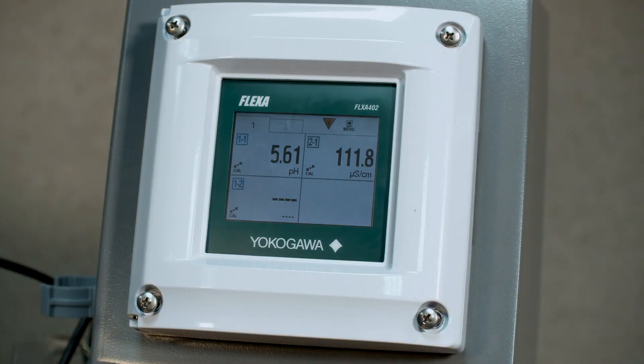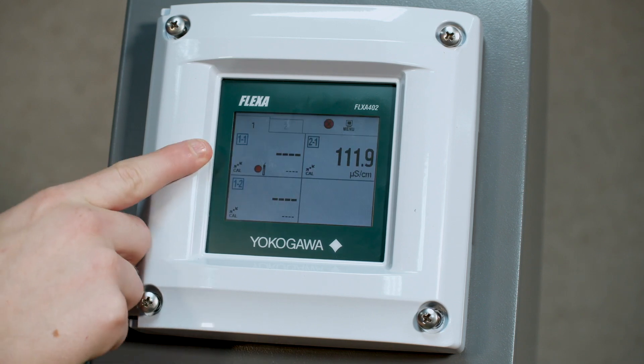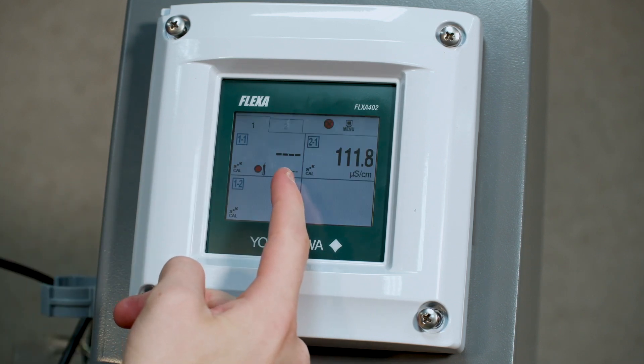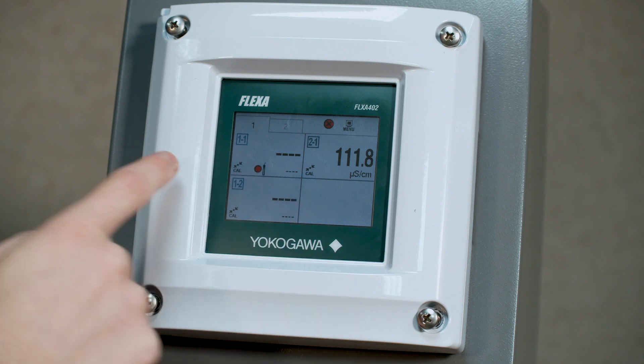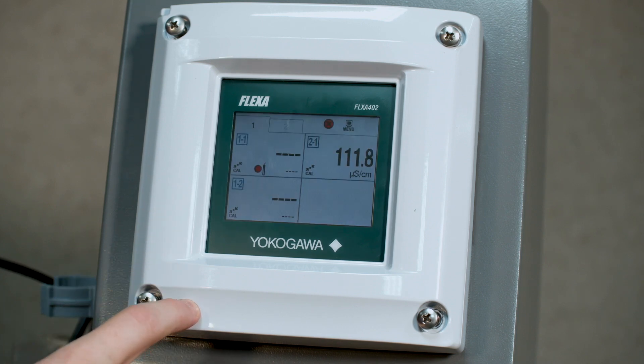Here, what we're going to expect is for these two windows to both show dashed lines and an error. This is because both of these sensors currently are set to the same Modbus address, which is right now 1. In order to set different Modbus addresses, you will connect to it using the free calibration tool.